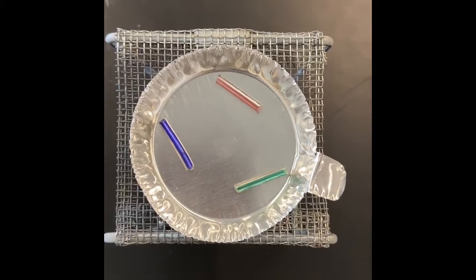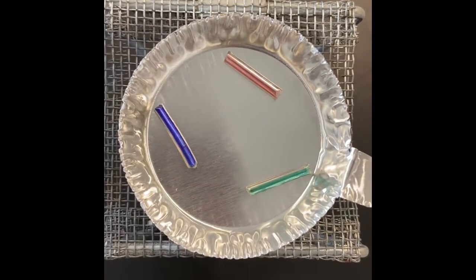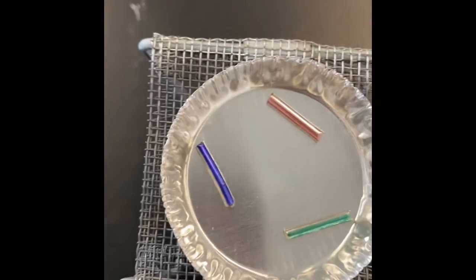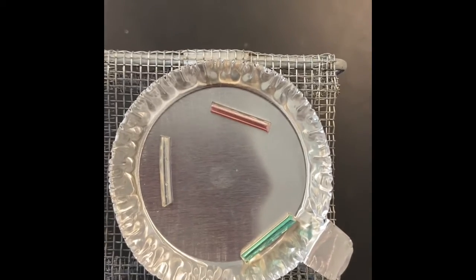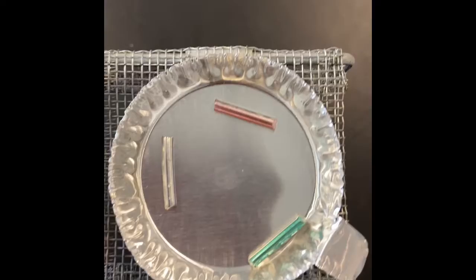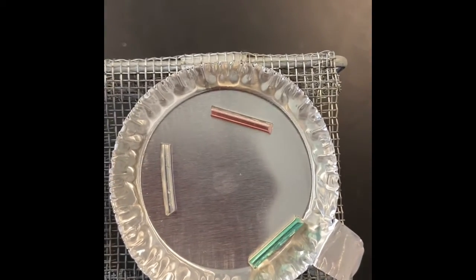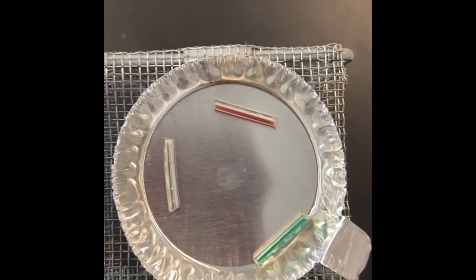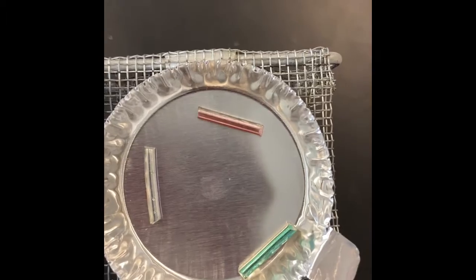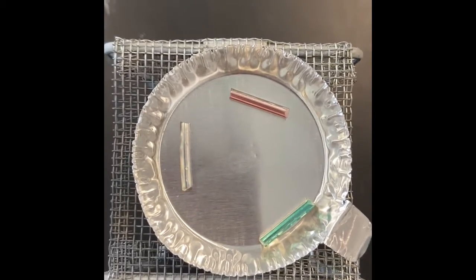For our third and final part of this experiment, I wanted to look at a mixture that might be a bit more unconventional. Here I have 3 pieces of solder. Now solder is just a small piece of metal that is actually a mixture of a few different metals. It's an alloy, and it is designed to melt at a fairly low temperature. Solder can be used to sort of like weld things, maybe on a circuit board. You may have seen it doing some small projects around your house before.